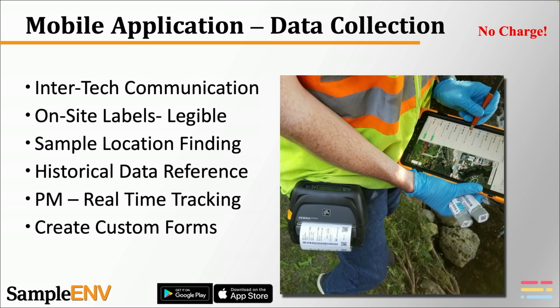Samples are listed from clean to dirty by default. If you've uploaded historical data, the app will look back at the data from the last time it was sampled, total all the contaminants, and then sort the locations from clean to dirty. It's always a good quality control measure to sample locations from the cleanest ones first to the dirtiest ones last. It'll also resort locations alphanumerically, which makes finding a particular location easier if you have a long list of samples.